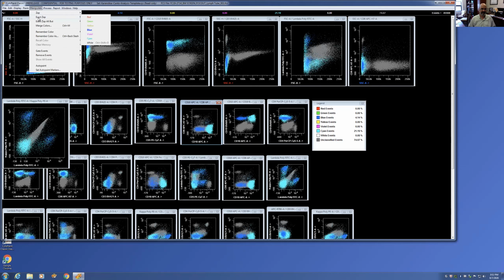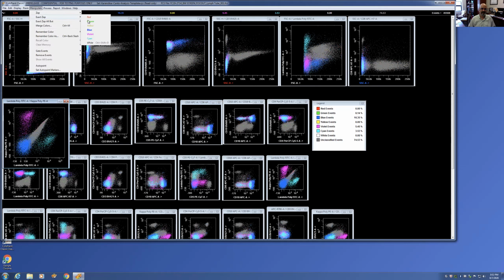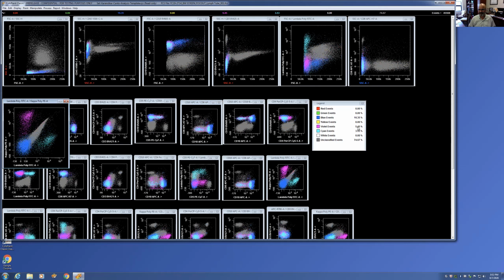Another thing you could have done if you wanted to do it a different way is you could have said, okay, right from the B cell population, I'm going to do a Kappa and Lambda ratio. So I'm going to circle the Kappa to make it violet. Then I'm going to circle the Lambda, all of it, to make it cyan or light blue. And now I do a violet to cyan ratio, so about 5:3. So it's a normal polytypic B lymphocytes over here. So the B cells are normal, except there's a lot of hematogone hyperplasia.